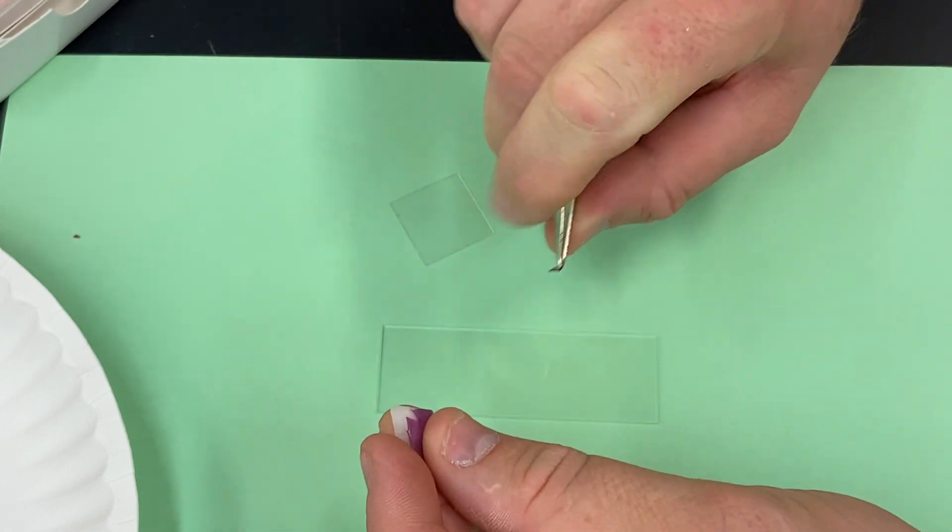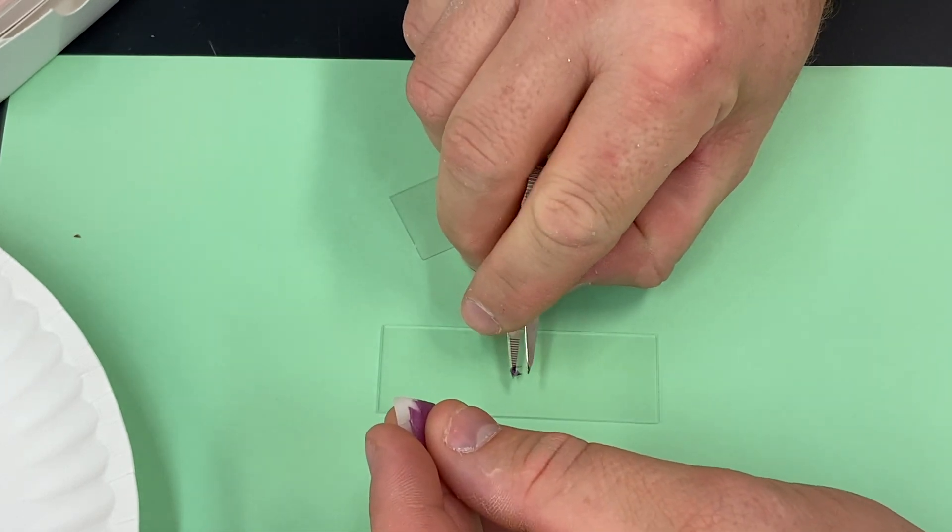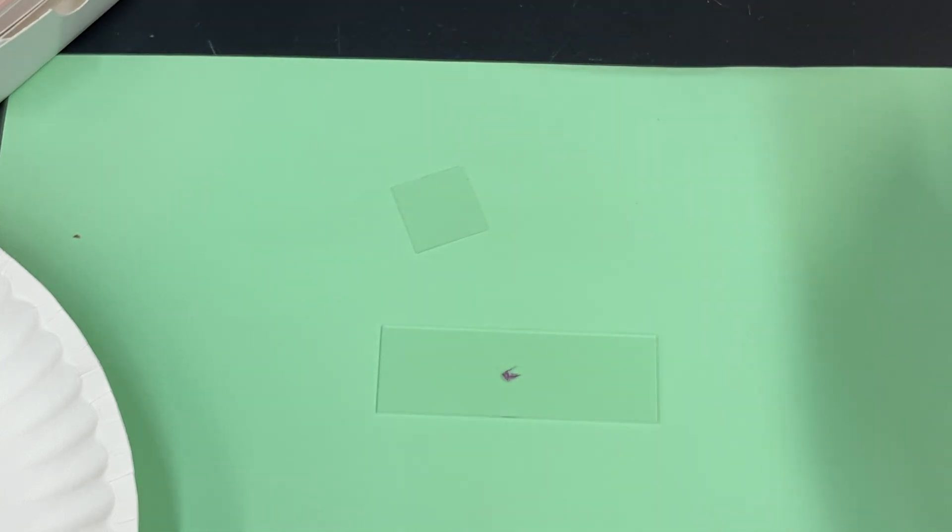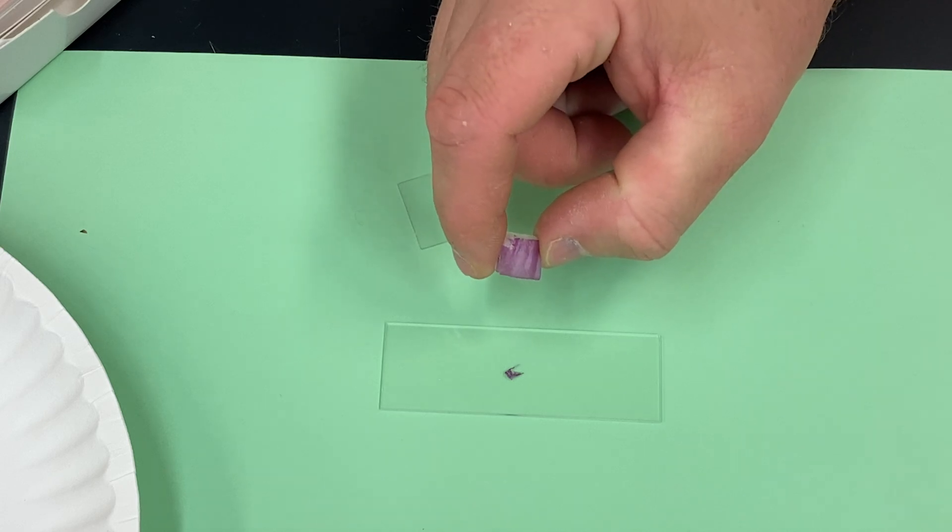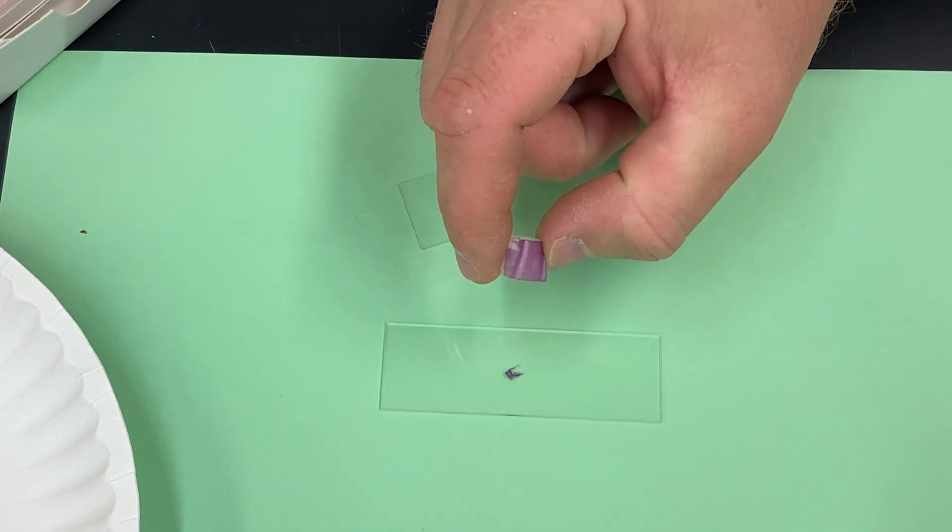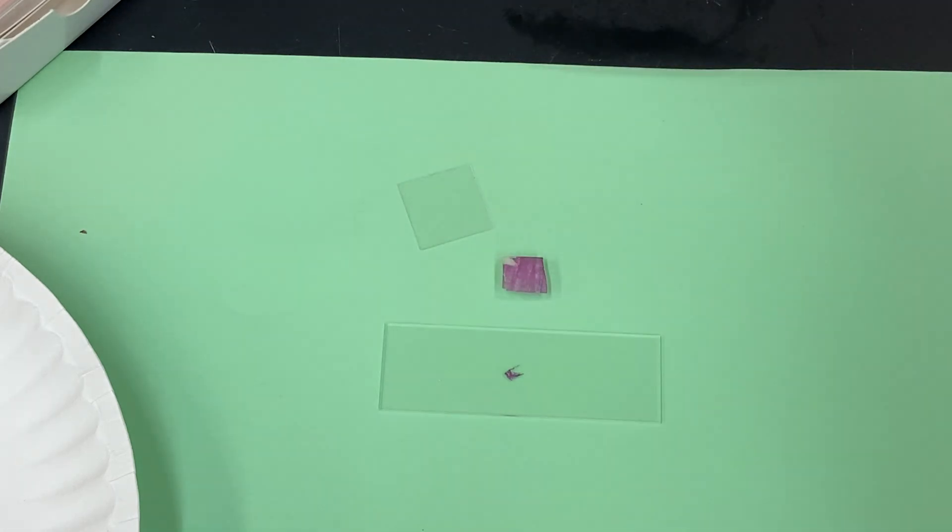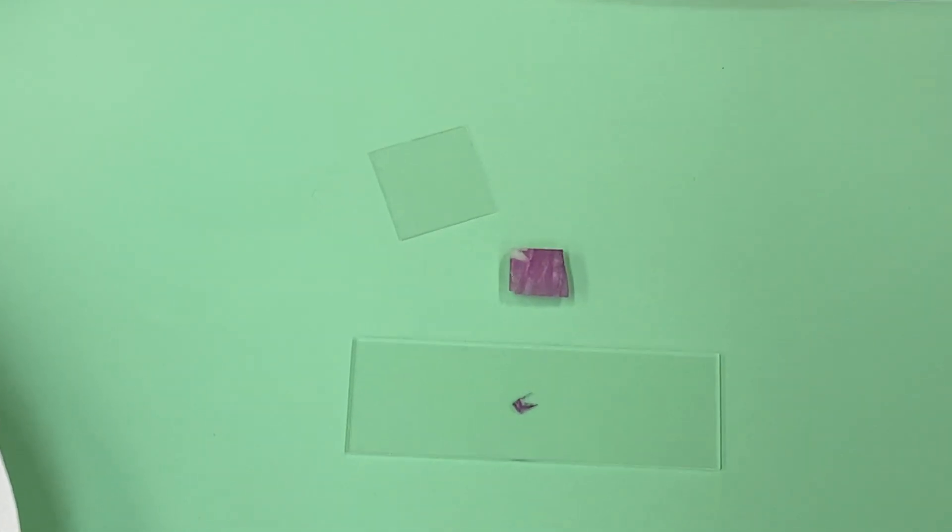This one was not that bad, and you just want a tiny, tiny little piece just about like that. Just put that right on your slide. Now the nice part about this and the reason we use it for this lab is it is essentially pre-stained. We don't have to add any staining to it that's going to screw up any of our chemical results.